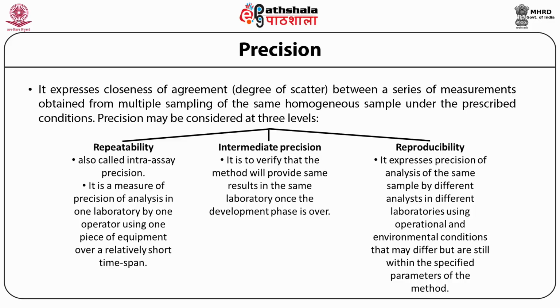The objective is to verify that the method will provide the same results despite differences in the room temperature, humidity, variedly experienced analysts, different characteristics of equipment such as delay volume of an HPLC system, variation in material and instrument conditions such as, in HPLC, the mobile phase composition, pH and the flow rate, equipment and consumables of different ages, columns of different suppliers or different batches, and the solvent, chemical reagents and other materials with different quality.